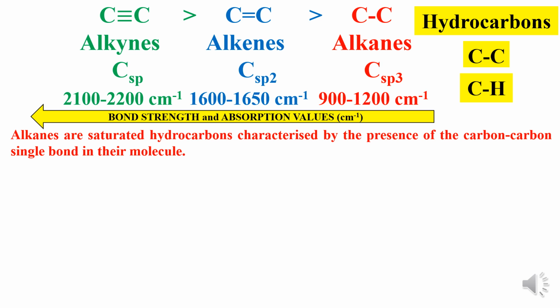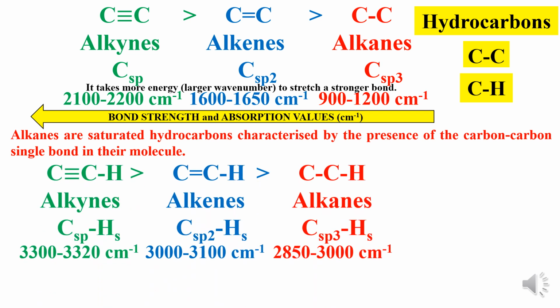Now, the carbon-carbon triple bond is stronger than the carbon-carbon double bond, and in turn, the carbon-carbon double bond is stronger than the carbon-carbon single bond. So, as the bond strength increases, the absorption value also increases. That is to say, it takes more energy or a larger wave number to stretch a stronger bond. Stronger the bond, more energy required to stretch that particular bond. Now, that is about the carbon-carbon bonds.